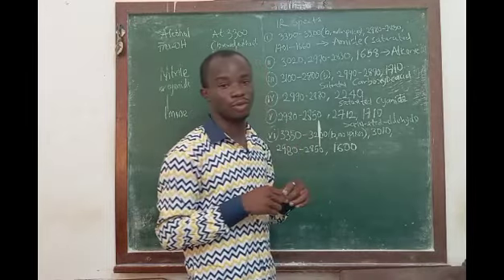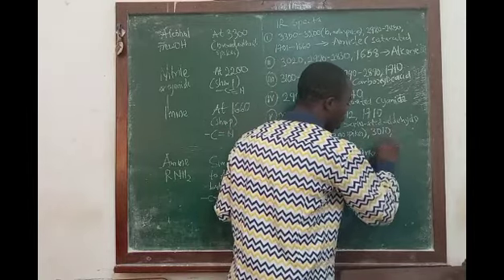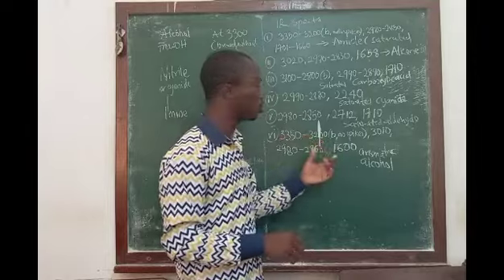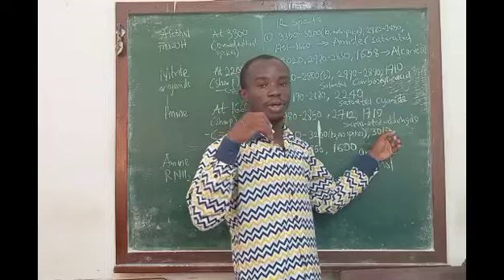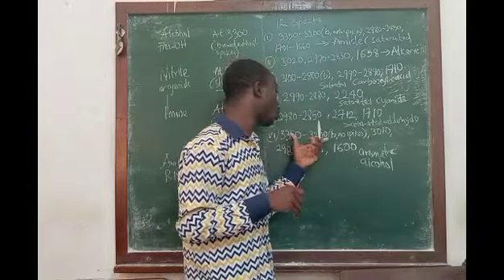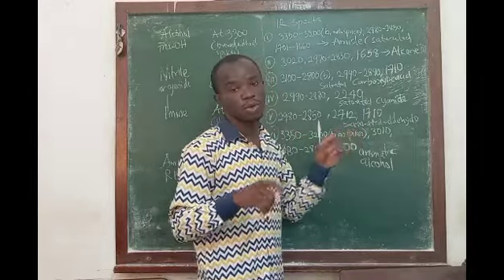With these two features, we can conclude that the compound is an aromatic alcohol, because of the signal just above 3000 and a signal at 1600, and an alcohol because of the broad signal around 3300 with no spikes.